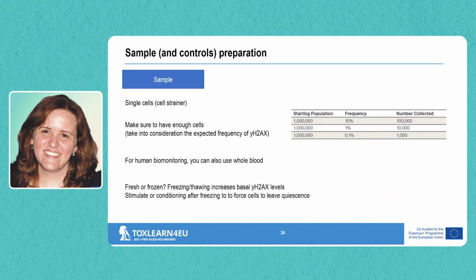But you will always have differences. It will never be the same as analyzing it fresh. I would suggest you make a few samples and see what the differences are, decide if you think that will really impact your result or not, and then make a decision. But be sure to not forget this question.